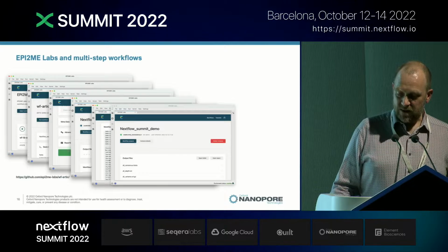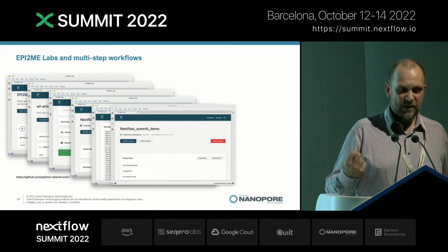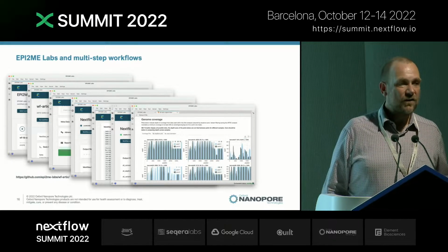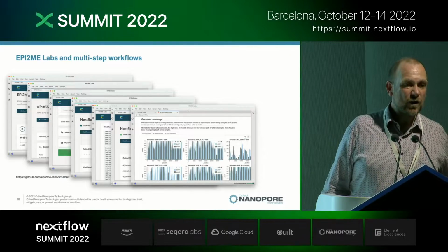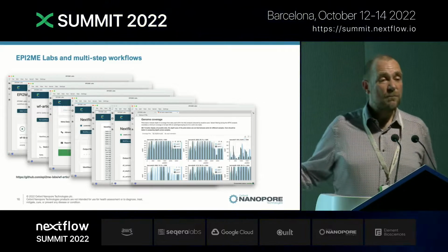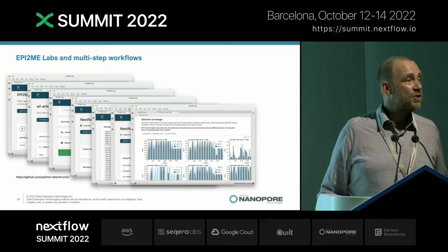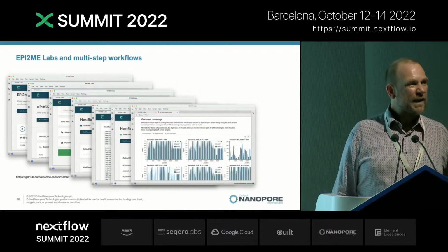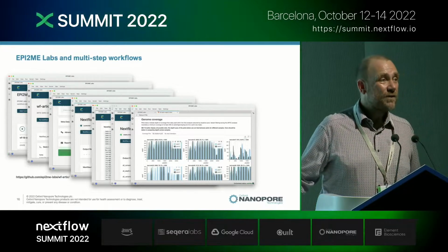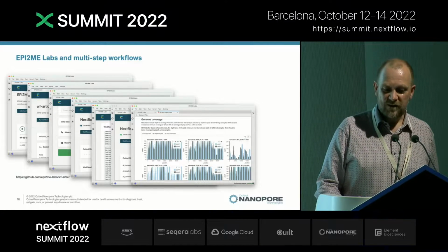It's finished here to the extent that it's providing me with a collection of files, and it's got a nice button, Open Report. Hit the Open Report button, and here we have the SARS-CoV-2 report. Here we've just got an excerpt of the report. It's a fairly long HTML file, but within this file we have the particular coverage plot that is giving us a little bit of insight as to the depth of coverage across the individual amplicons, and this is one of the key QC features that our users should be looking at before they look at the strain identification and make the call that yes, this genome could or should be submitted to GISAID.